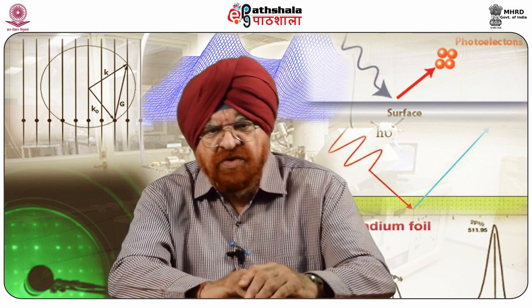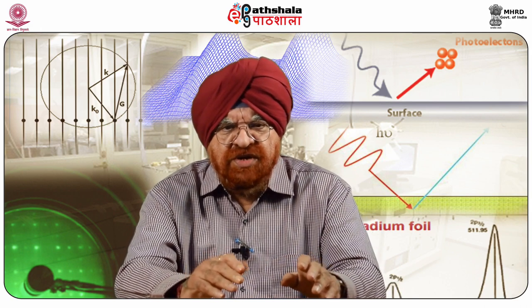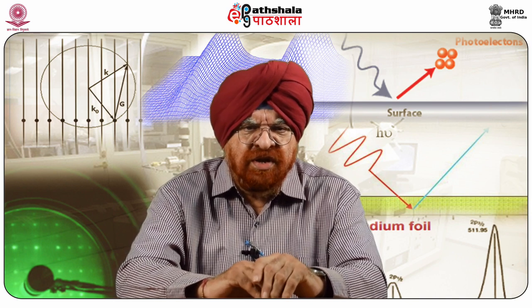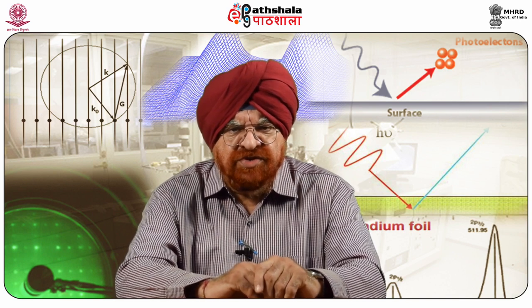Photo-emitted electrons can undergo various processes like inelastic collisions, recombination, extraction of the sample, recapture in various excited states within the material. This causes reduction in the number of escaping photoelectrons. Once these photo-ejected electrons are in vacuum, they are collected by an electron analyzer, photomultiplier tubes, or hemispherical detectors that measure their kinetic energy.